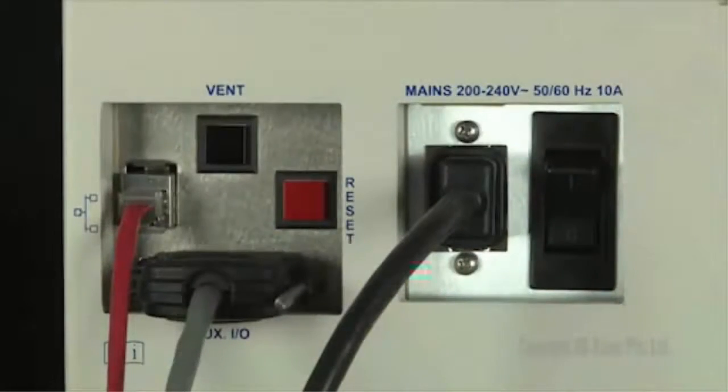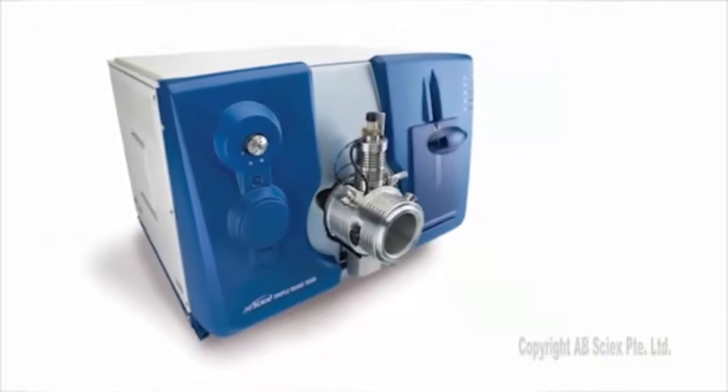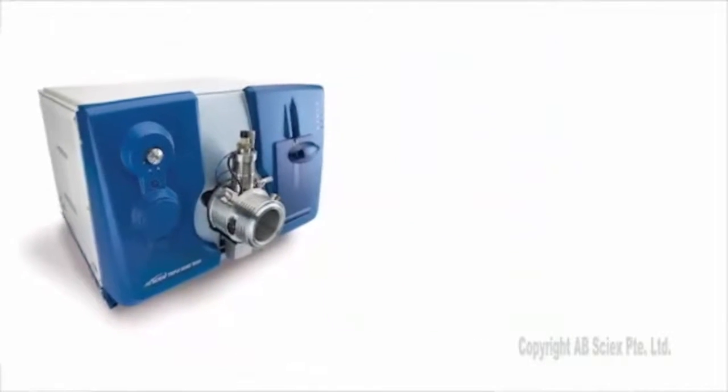Power on the mass spectrometer by pressing the black power switch to the on position. On the 5500 series of instruments, this will also start the roughing pump.